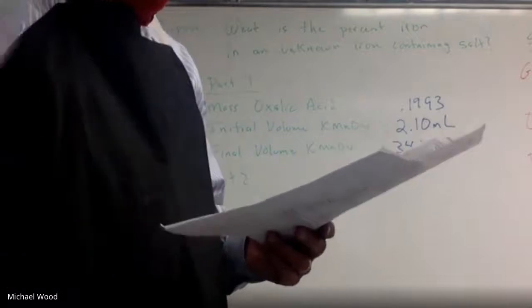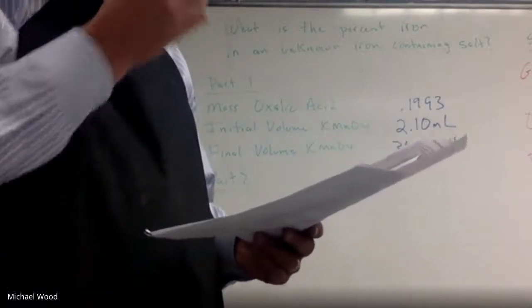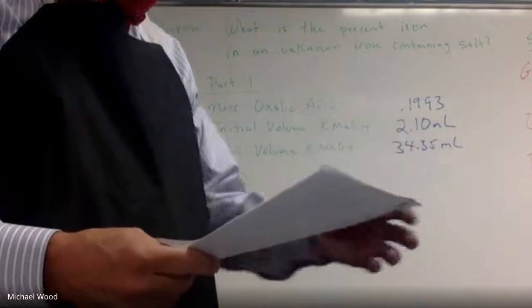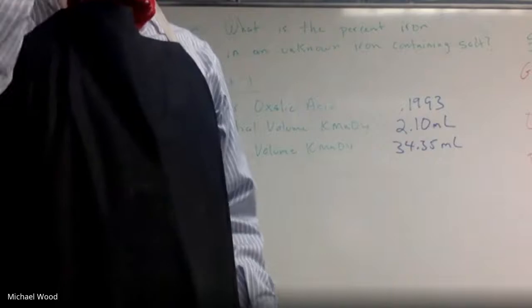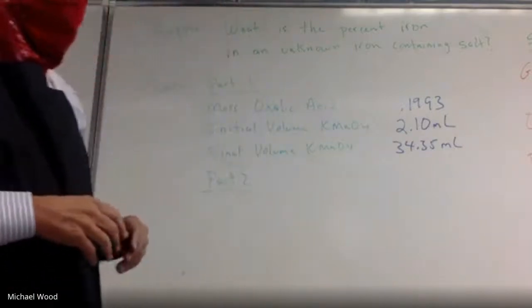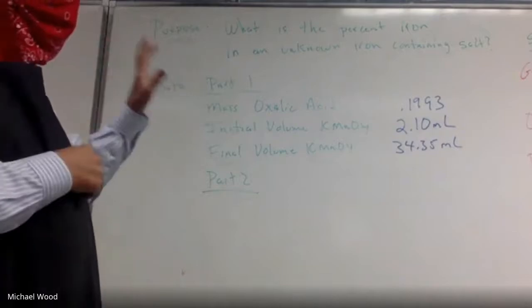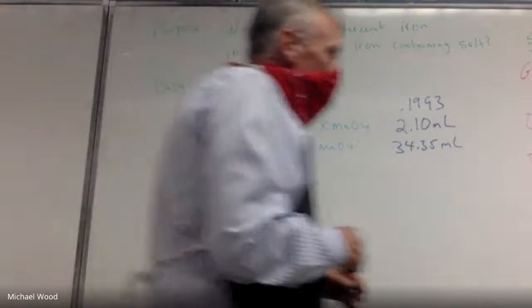And it's going to be the same idea. You're going to have the initial volume and the final volume. And again, if we get in the ballpark on trial 1, we won't do trial 2. I will tell you that I think you need to add at least 12 milliliters. And you might want to write yourself a note. You're going to need at least 12 milliliters to do that. So, okay, I'm going to leave that for today. I want to come back a little bit later in class and talk about that.